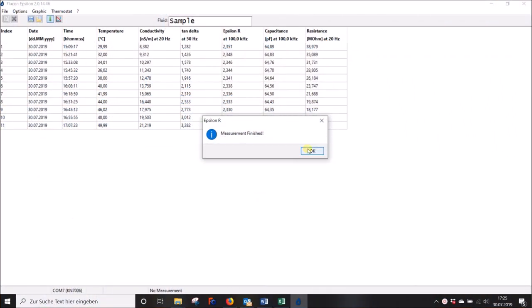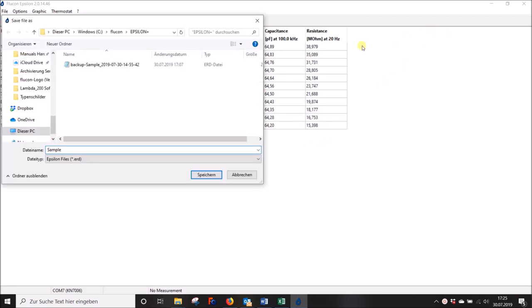When your measurement was finished, a message will be displayed within the program. Click on OK and you will be given the option to save your protocol to a directory of your choice.